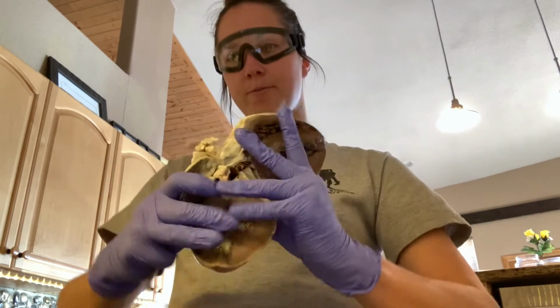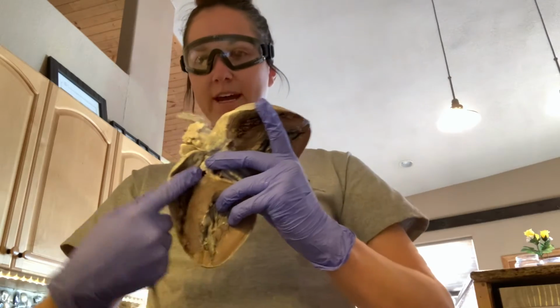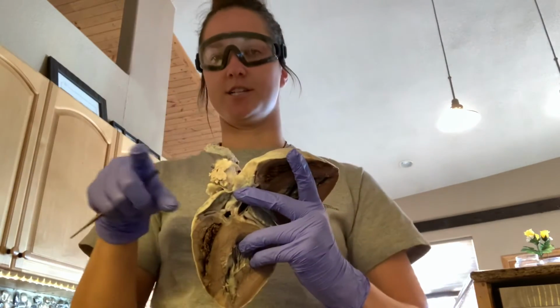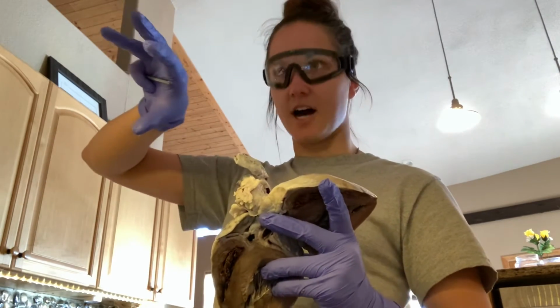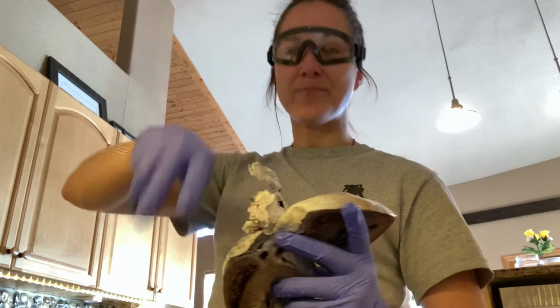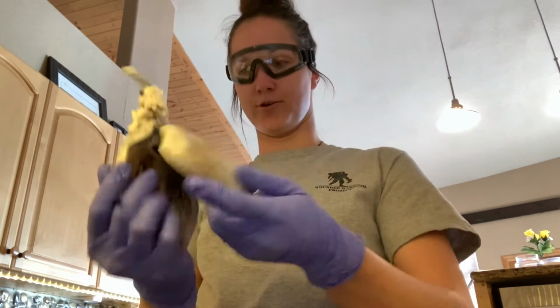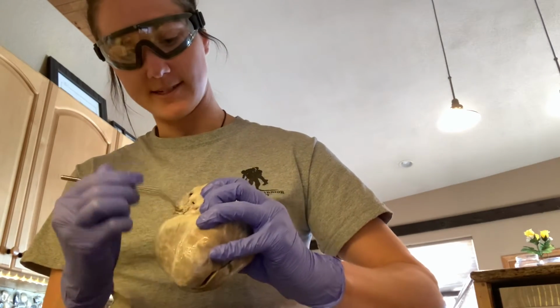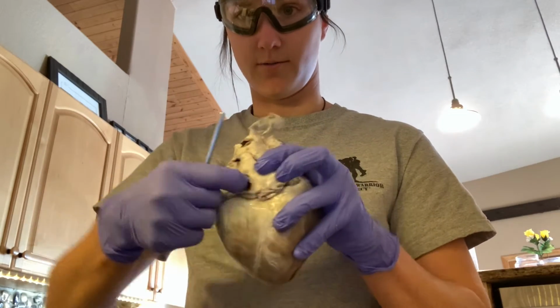Now, from the right ventricle, we have the pulmonic valve that shoots the blood into the lungs to be reoxygenated. Then we get that blood oxygenated with oxygen, then it comes back through to this part of the heart, and this is the start of the left atrium, this little hole here.